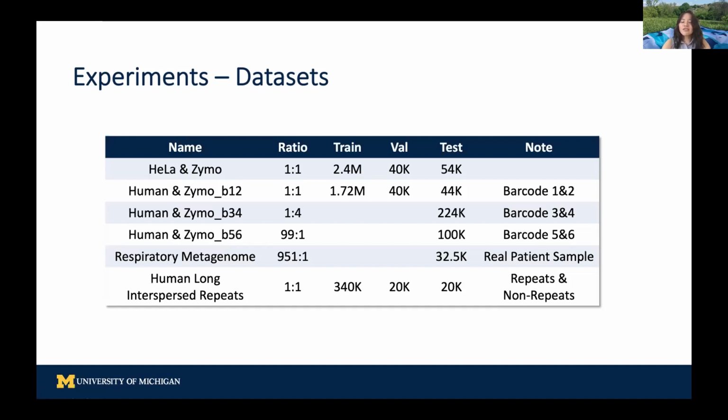We discarded the first 1,000 to 2,000 signals of each read to remove the adapters and the barcode and prevent the model from cheating. The other 2 data sets were generated from the procedures linked in the paper. We split the first 2 data sets into training, validation, and testing, and used all the other data sets for testing. Note that these data sets come from different sample preparation procedures, flow cells, and different composition ratios.